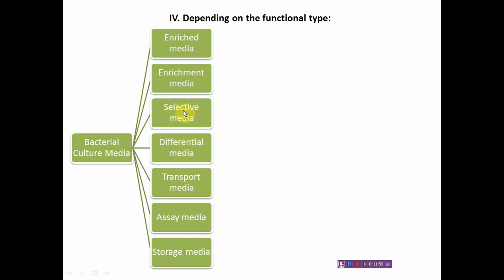Selective media are used for isolation purpose. Enrichment media and selective media are both the same, but enrichment media don't have any agar, and that is why they remain in the liquid state. This enrichment media is used for inhibition of unwanted cells.